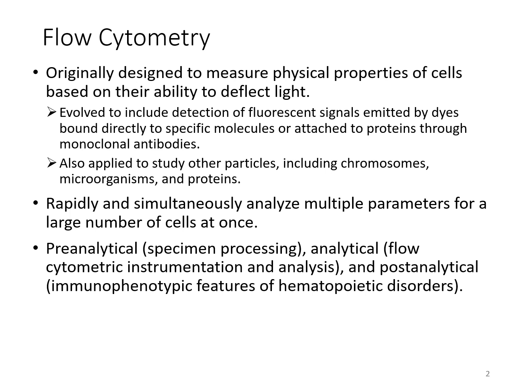Flow cytometry actually uses light scatter, light excitation, and the emission of fluorochrome in order to give us various data from different cells and particles within the sample that we run through the analyzer. All this data composed together allows us to measure the quantity of cells, the size of those cells, any sort of morphology, and any of the internal and external structures of the cells that we're questioning and trying to figure out exactly what they are.